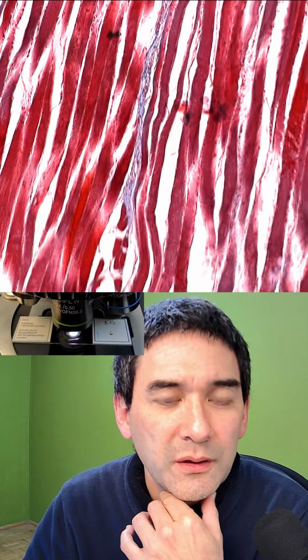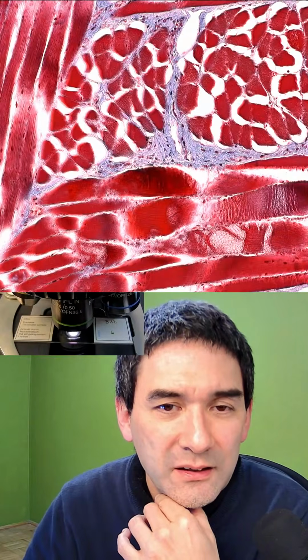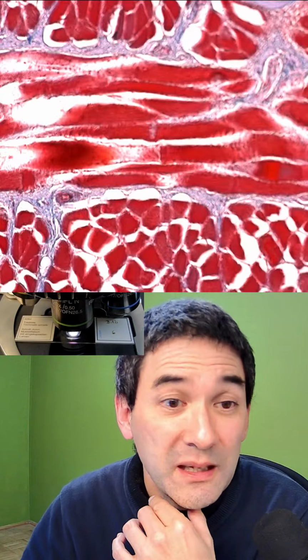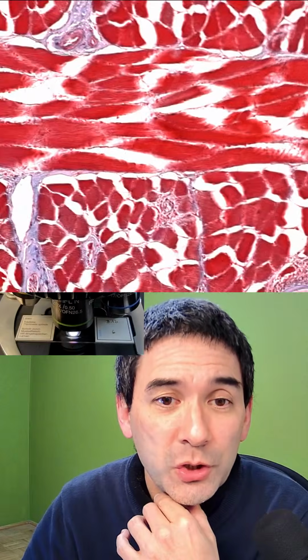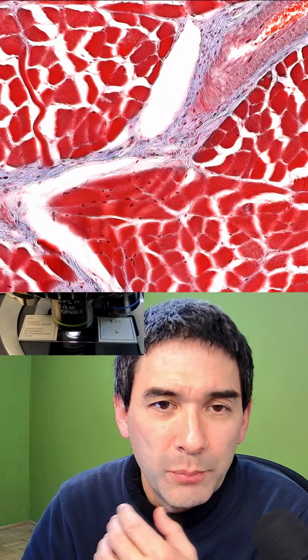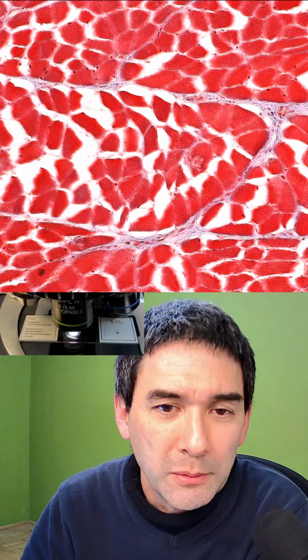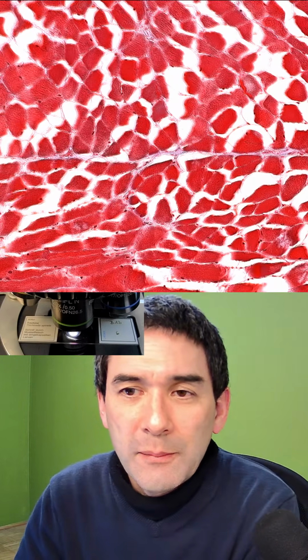In any case, that is a nice sample of muscle tissue with a couple of those trichinella nematodes, worms, which are basically parasites. That's why you should always cook pork quite well. But to my knowledge, all of this pork is tested these days, so it shouldn't be a problem. So I'm going to do the following.